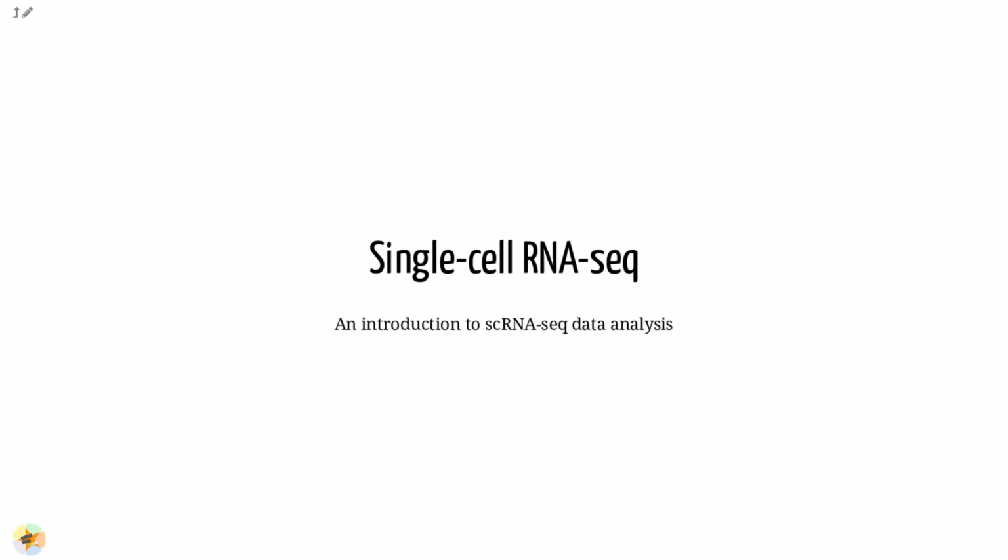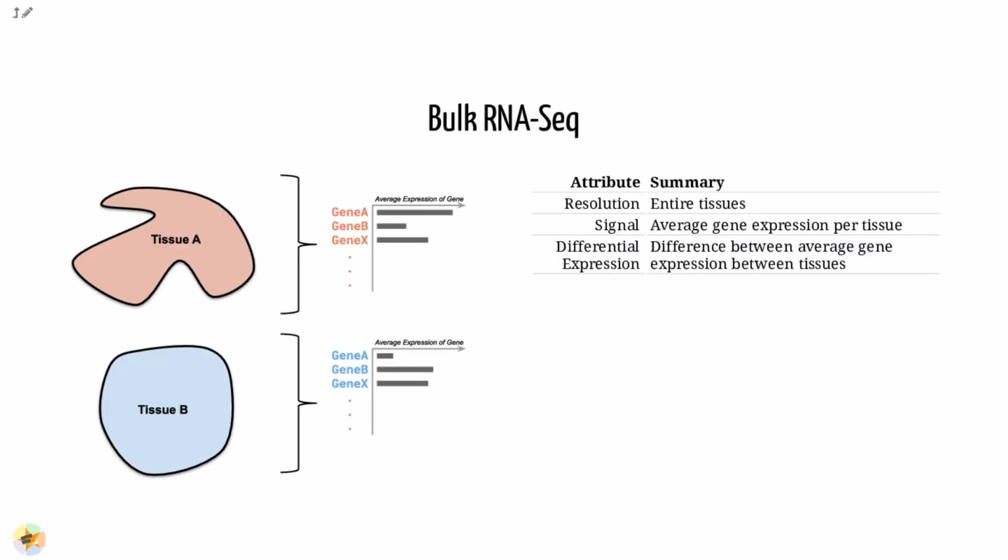Greetings everybody and welcome to the Galaxy Single Cell RNA-seq Analysis Workshop. Here we will walk you through some of the basics and concepts when dealing with single-cell data. Let's start with what the differences are between bulk RNA-seq and single-cell RNA-seq data.